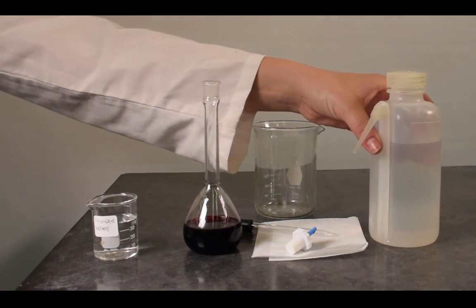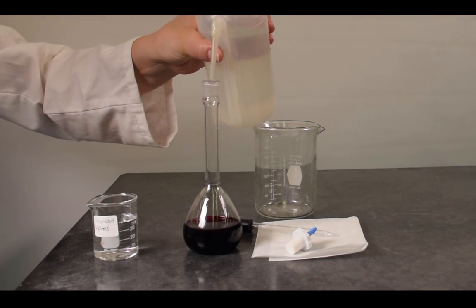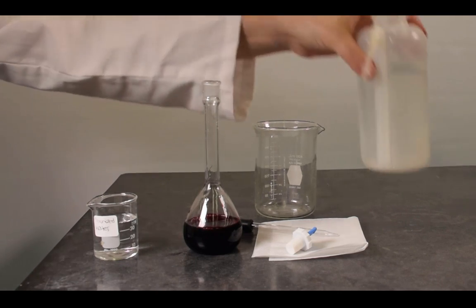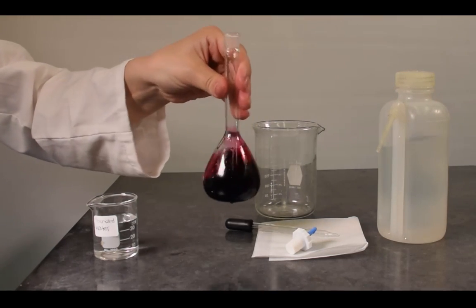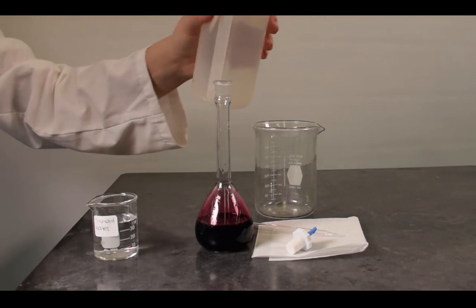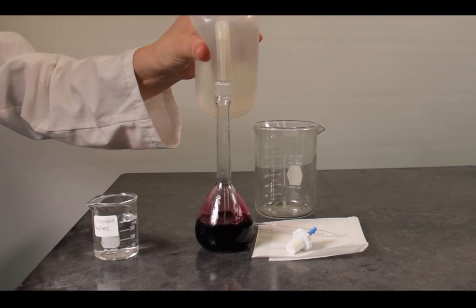Fill the volumetric flask to two-thirds of its volume with the required diluent. In this example we are using deionized water. Once the flask is two-thirds full, swirl the flask to initiate mixing. Be sure to not stopper the flask at this point.